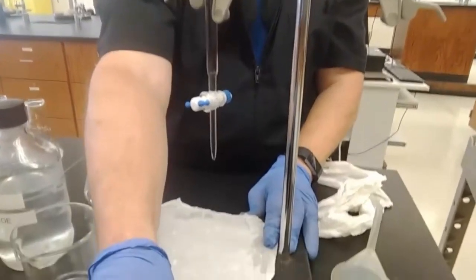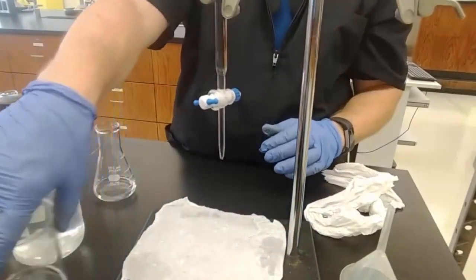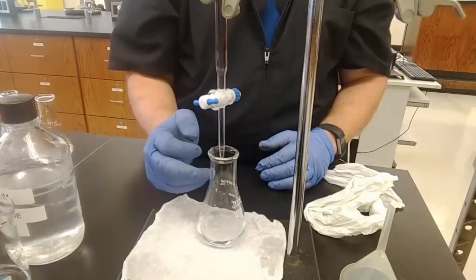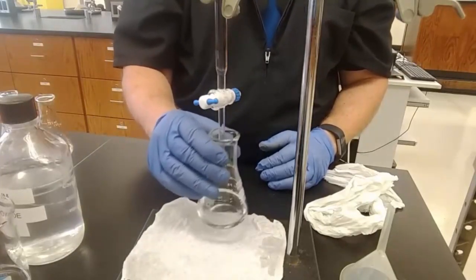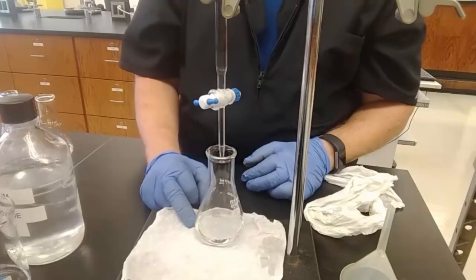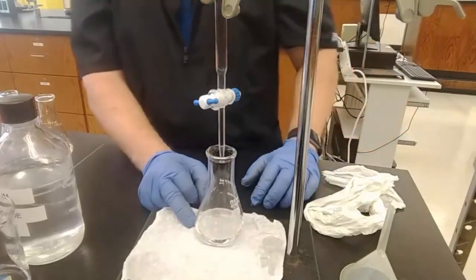Move this closer where you can see it. See all the action. First, flask underneath. Notice the tip is in the flask so that as I'm swirling it around, I don't accidentally miss a drop. Now you could put a stirring bar in here and put this on top of a magnetic stirrer and have it stir for you, but let's go old school.